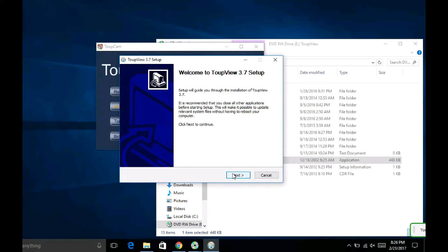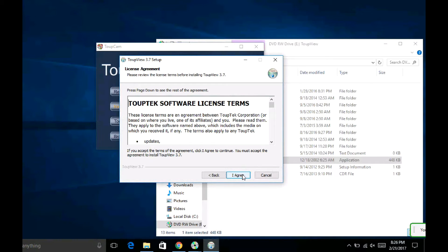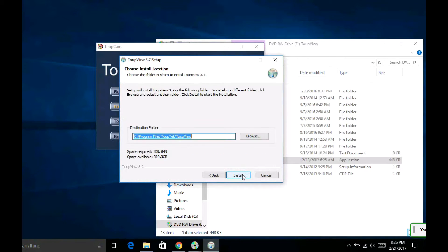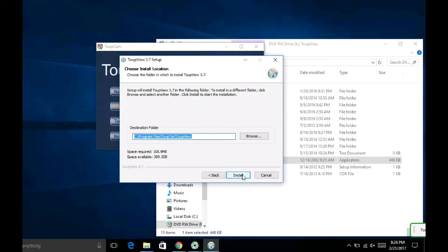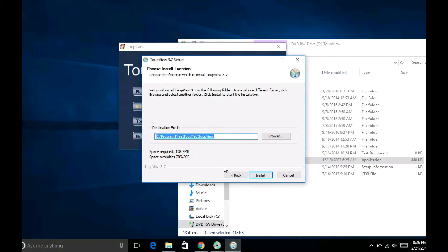Read the agreement, this is the software license terms. After that click agree, choose your destination folder, and it will use 108 megabytes of room on your hard drive.